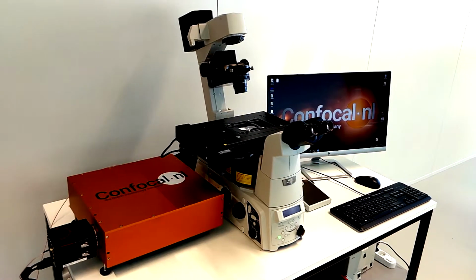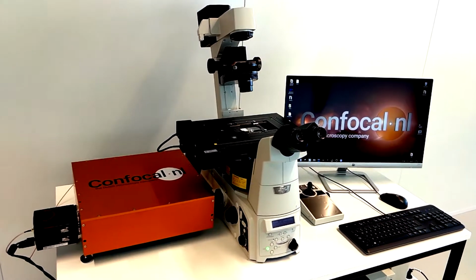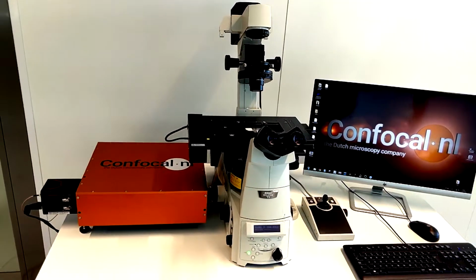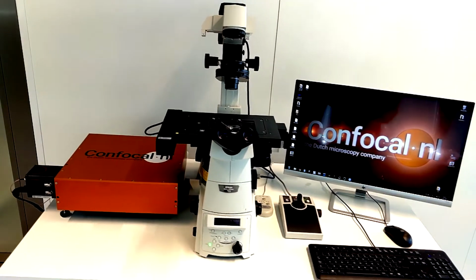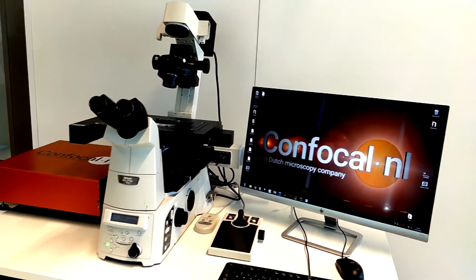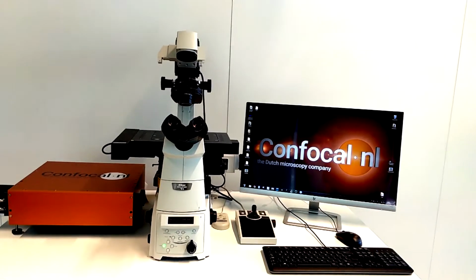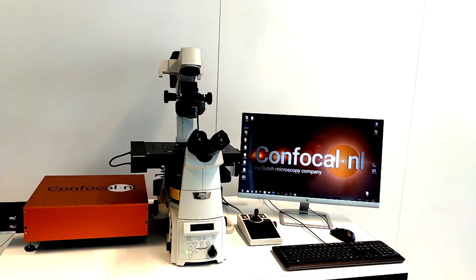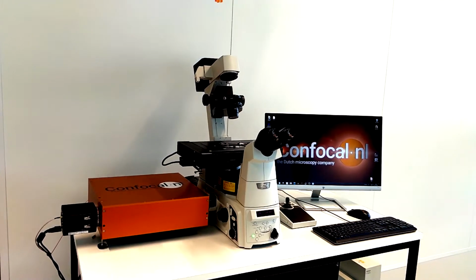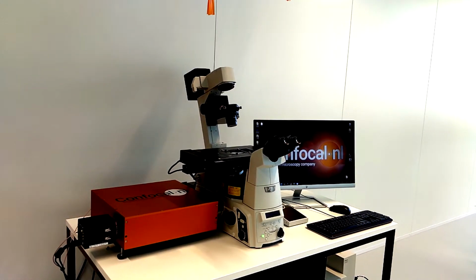Welcome to the tutorial on using the Rescan Confocal Microscope, or RCM, unit with the open source platform for microscope imaging, Micromanager. Micromanager supports multiple platforms, Windows, Mac and Linux, and provides an open plugin interface for adding new devices. Combined with ImageJ, Micromanager provides a full-featured microscope management and image processing package, comparable in capabilities to commercial solutions. It is distributed free of charge and under an open source license.